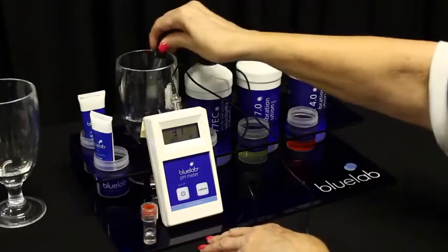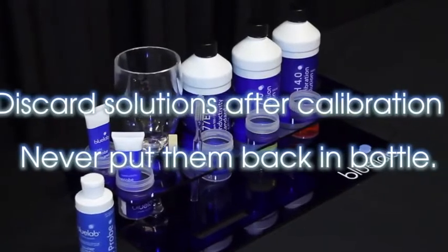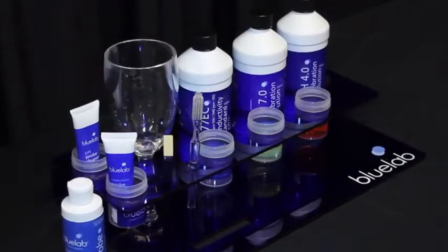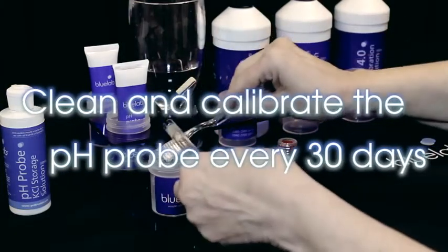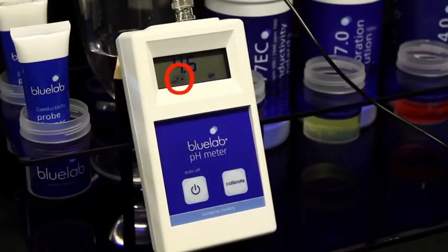Rinse the probe in clean tap water. Discard all used solution after calibration — never put them back in the bottle as you will contaminate the solution. Clean and calibrate the pH probe each month to ensure accurate readings. The calibration indicators will disappear one month after the last successful calibration to remind you it's time to calibrate again.